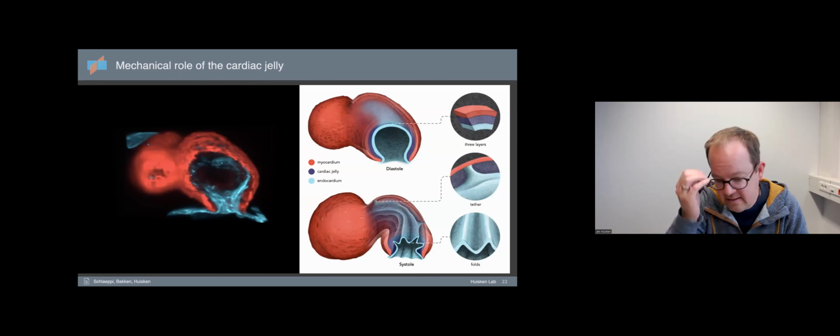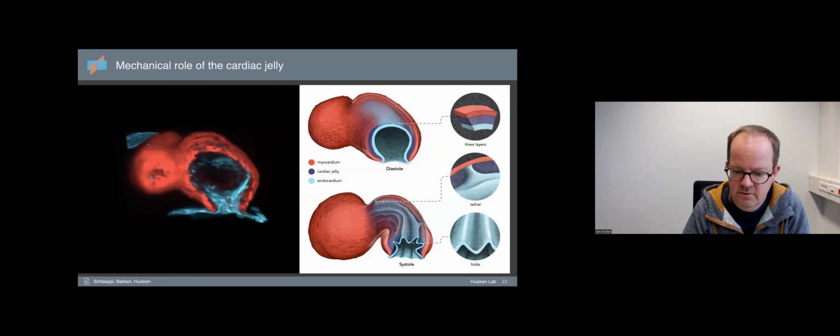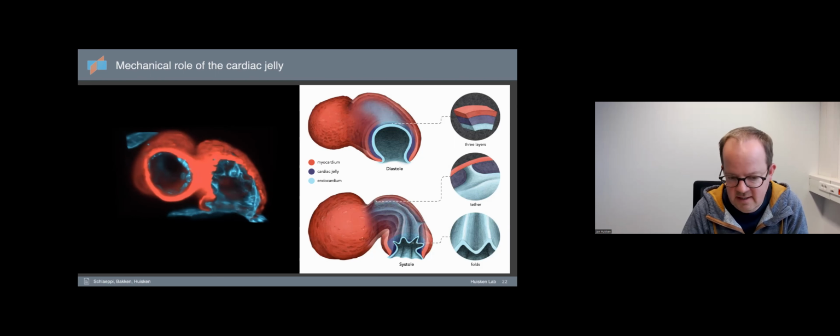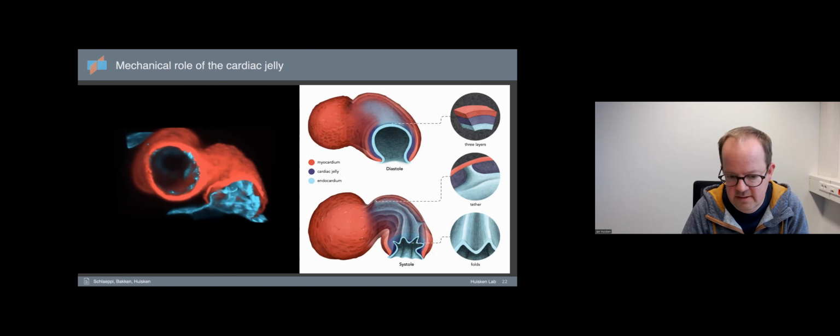So we've done this extensively by imaging hearts at an early stage, where in the atrium we can very nicely observe this interesting phenomenon that when the myocardium contracts, it folds the endocardium in an interesting, very reproducible pattern, namely in these folds that are held by these tethers that we can find throughout the atrium. And so with this technique, we've been able to get what we believe is a really nice high resolution, high speed insight into the mechanics of how the heart contracts.